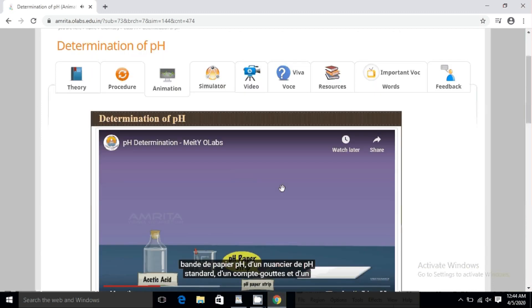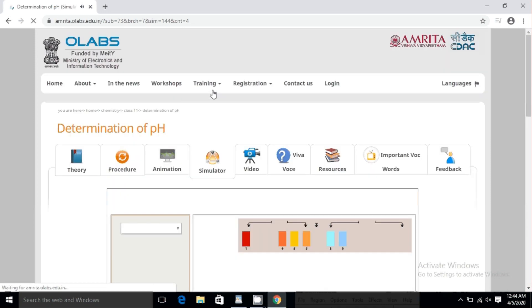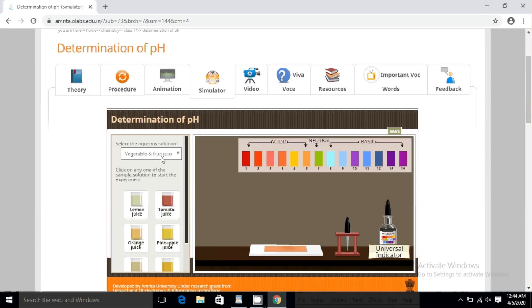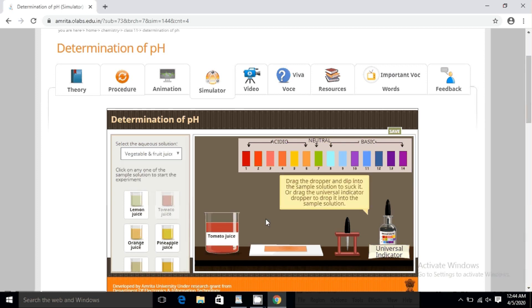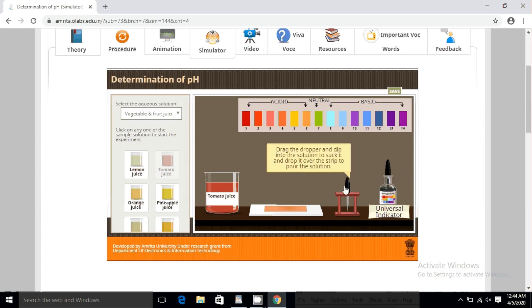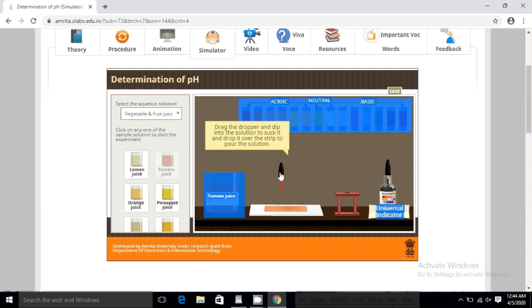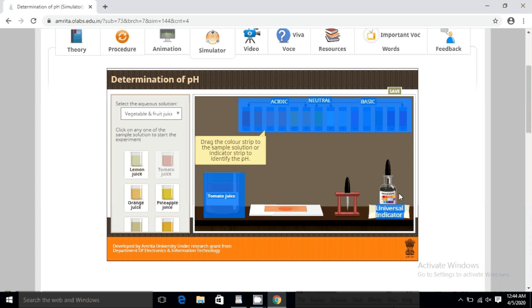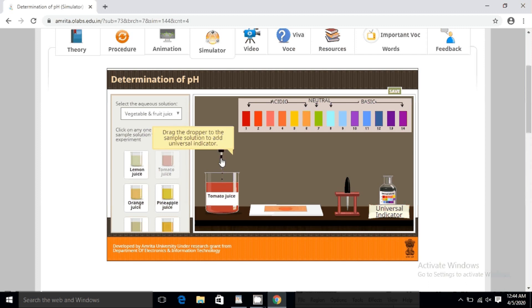Then you can go to the Simulator — your own experiment. In the simulator, you select your requirements for doing your practicals, then select the different procedures mentioned there, and start on your own, something like doing a practical in your own laboratory. Following the different procedures mentioned in the experiment, you then calculate your pH value.